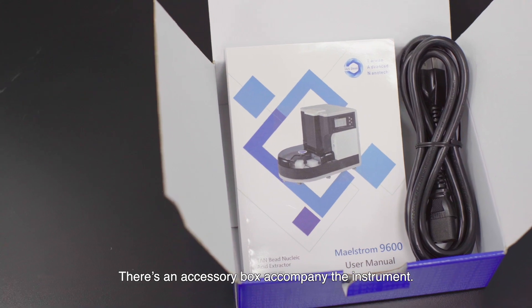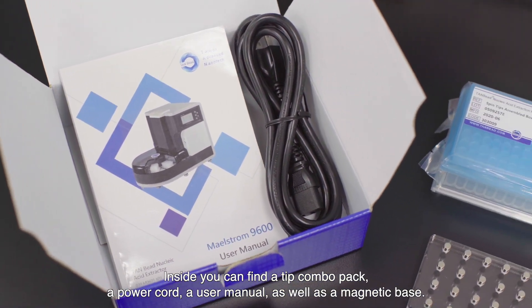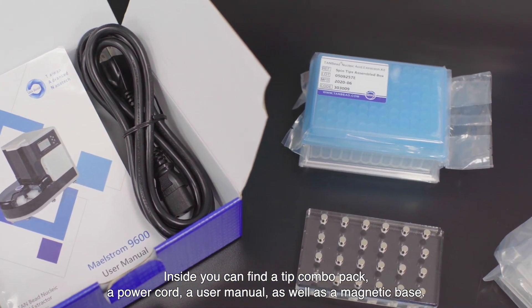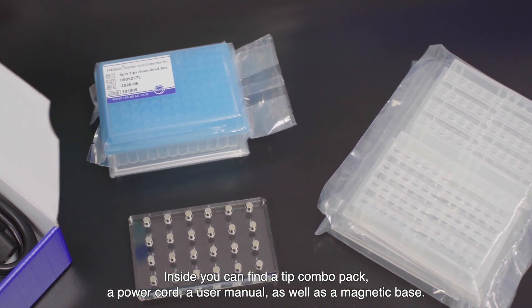There is an accessory box accompanying the instrument. Inside you can find the tip combo pack, a power cord and user manual, as well as a magnetic base.